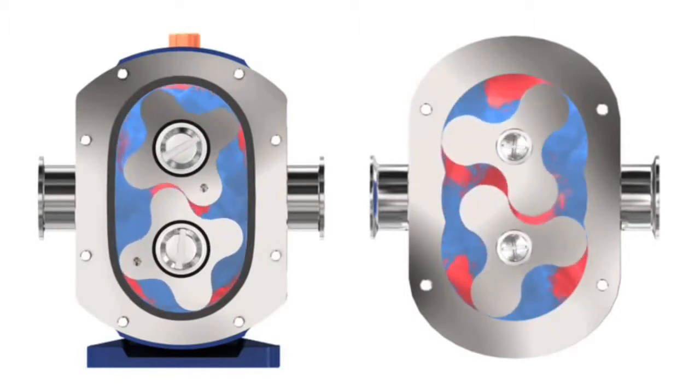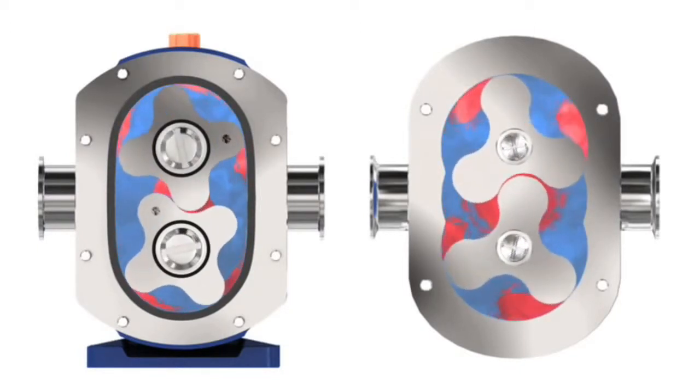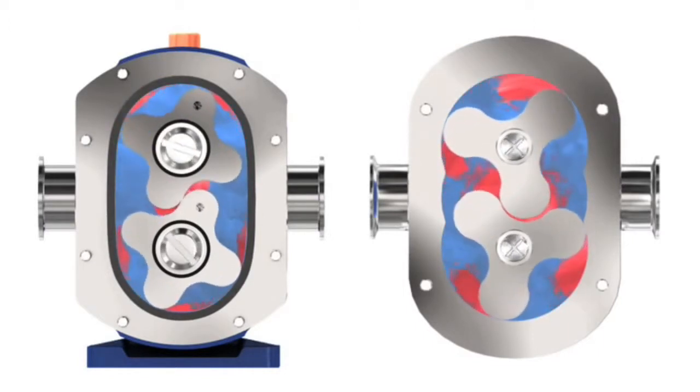The four-lobe geometry reduces shear of the liquid as it enters and exits the lobe cavity, and also reduces pulsation. It's perfectly suited for both cleaning in place and sterilization in place.